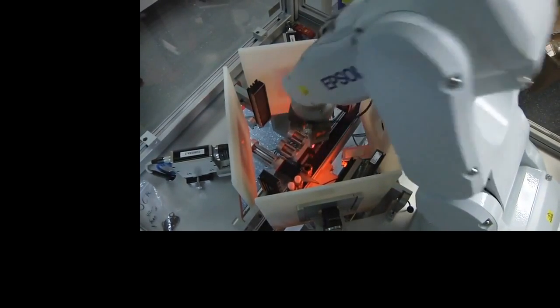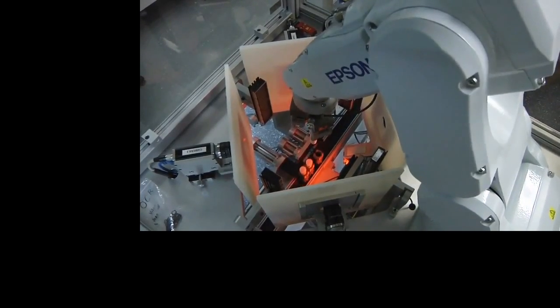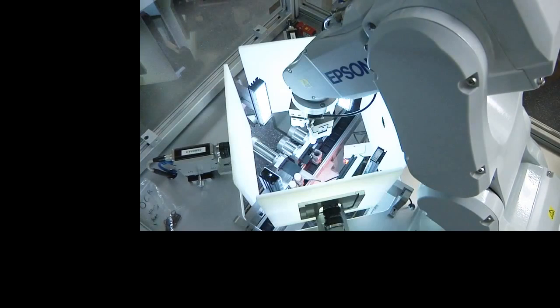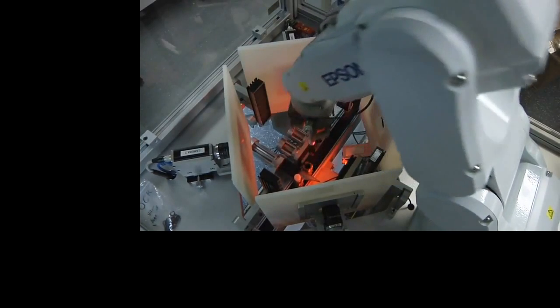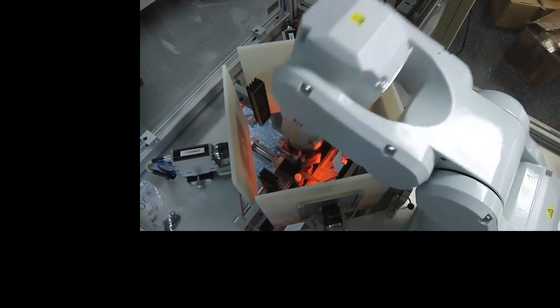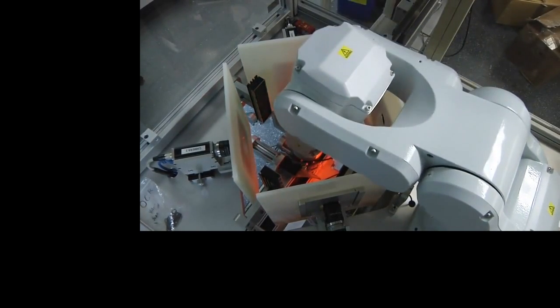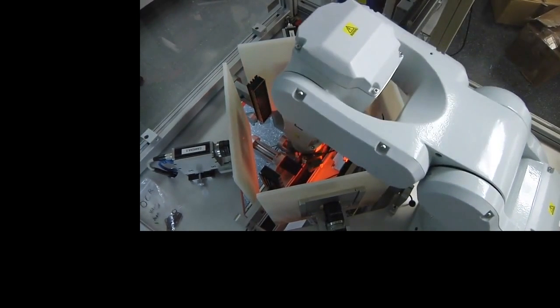There are 4 equally spaced cameras with 4 reflective panels and 4 strobe lights. As you can see from this pause in the video, the strobe lights are very bright. The vision system software precisely stitches the 4 separate photographs into a single photograph, which is the entire exterior of the tube and is so sharp that OCR can be performed.